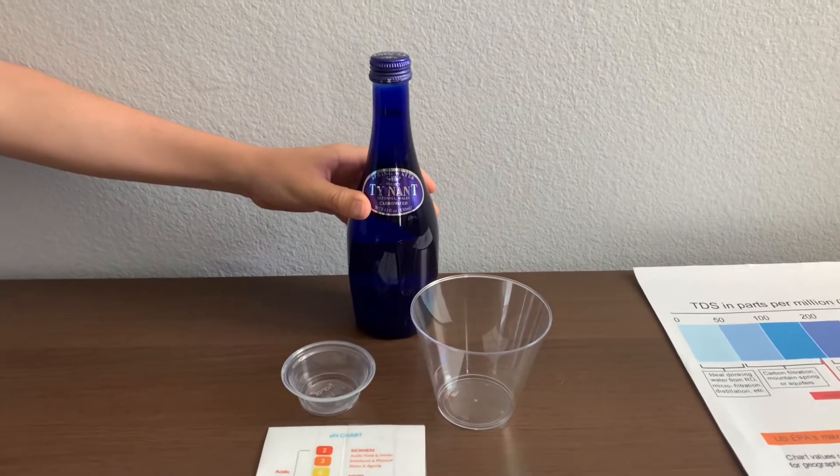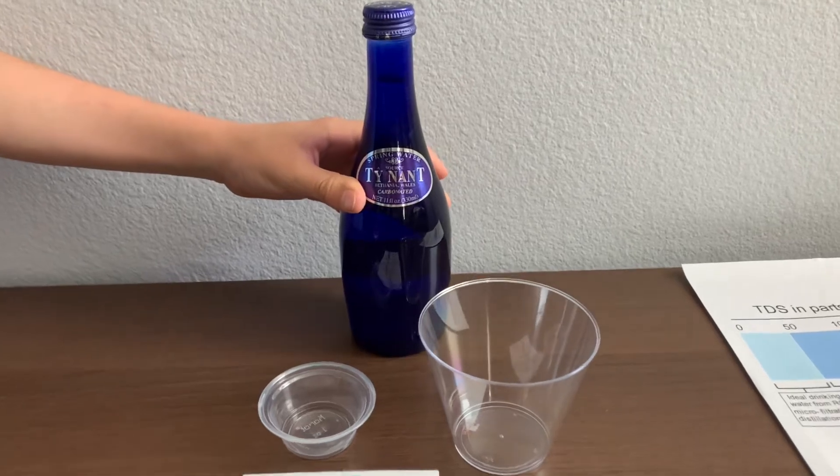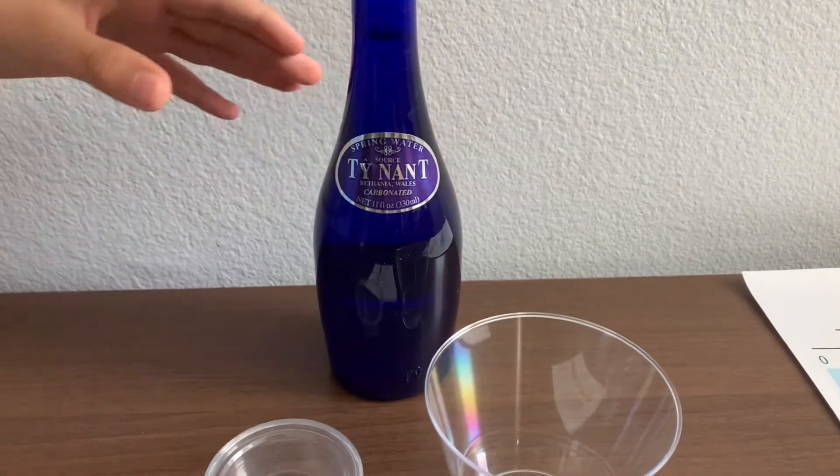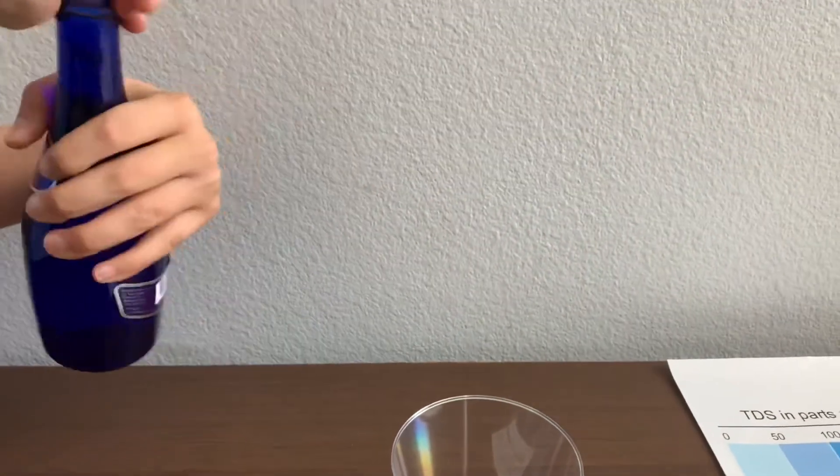This is Tŷ Nant carbonated spring water, bottled at the source of Tŷ Nant spring in the United Kingdom. Let's pour some water in.